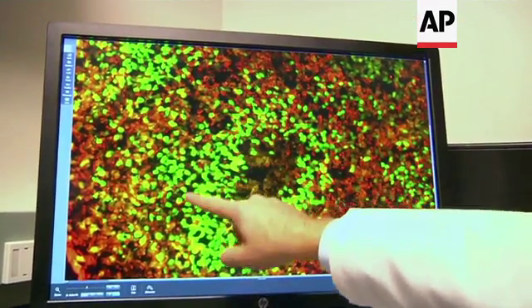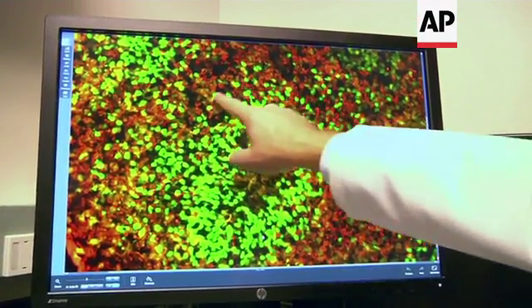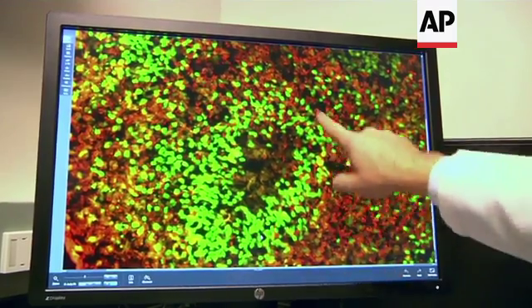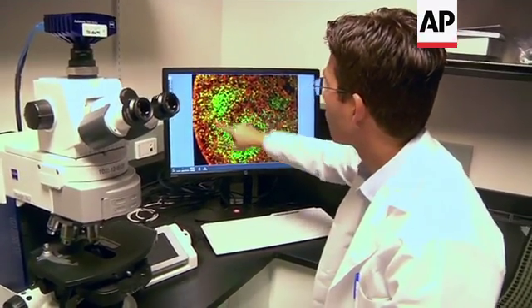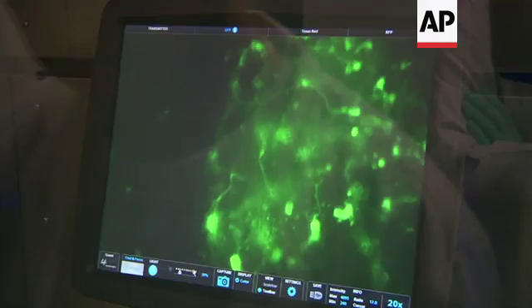So this is a region where there are multiple progenitors. Just a shot closer, which shows this very.